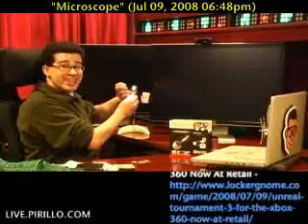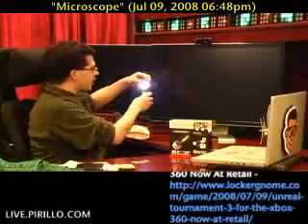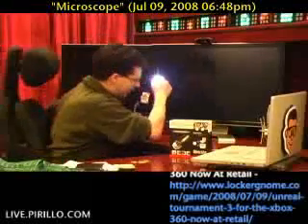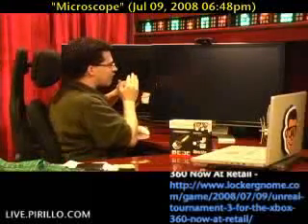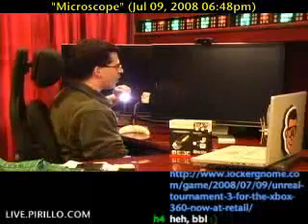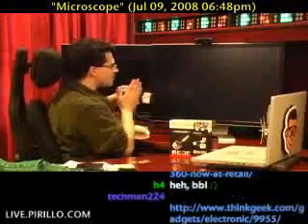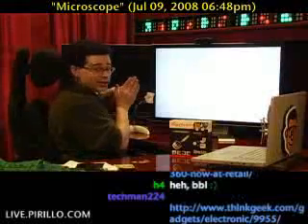The zoom mechanism is actually a dial on the microscope. I know what you're thinking — you're thinking, Chris, shut up already, show us some cool stuff. All right, so we've got the software running. I've got my screensaver kicked in — there we go, forgot about that. All right, here we go. Now we're going to start the tour.